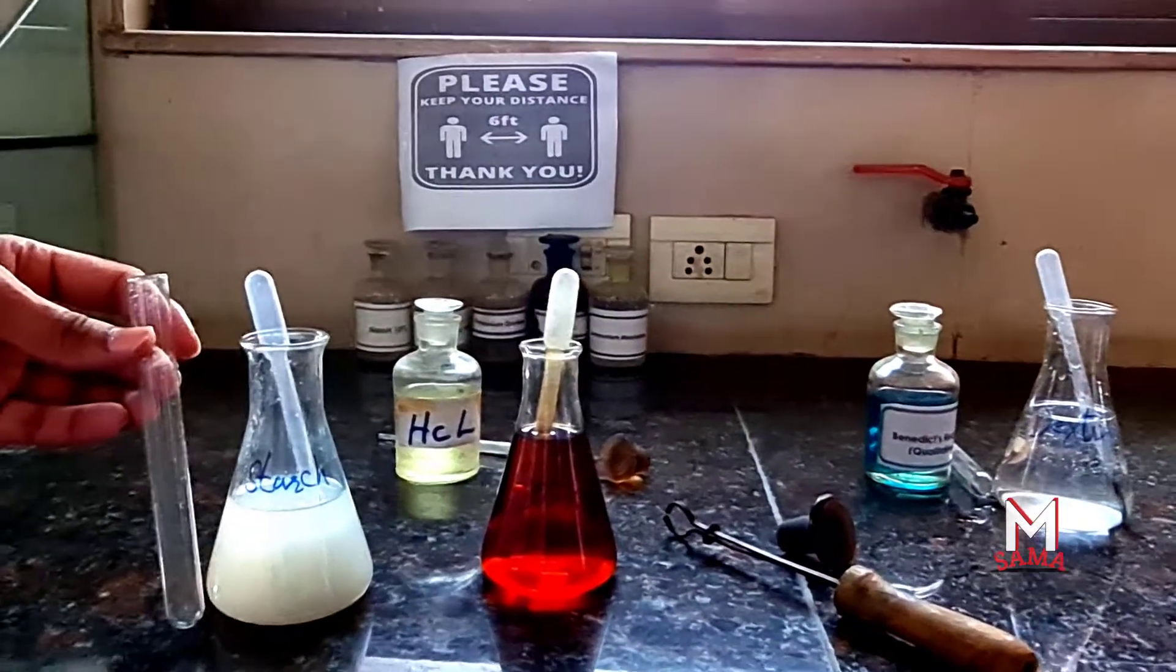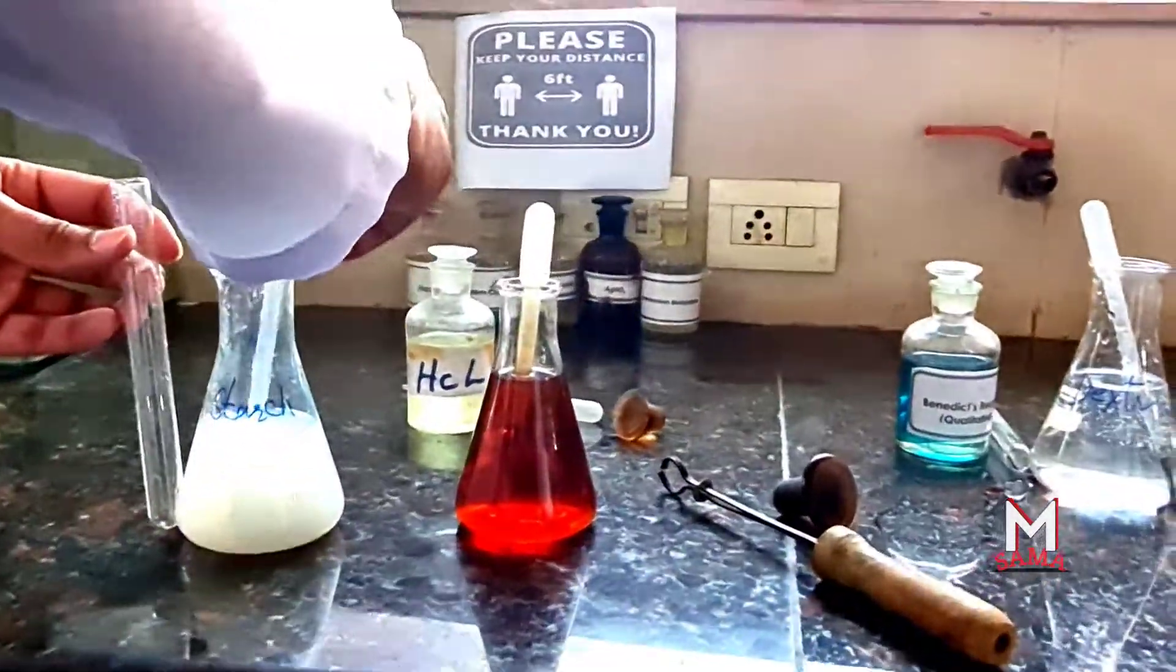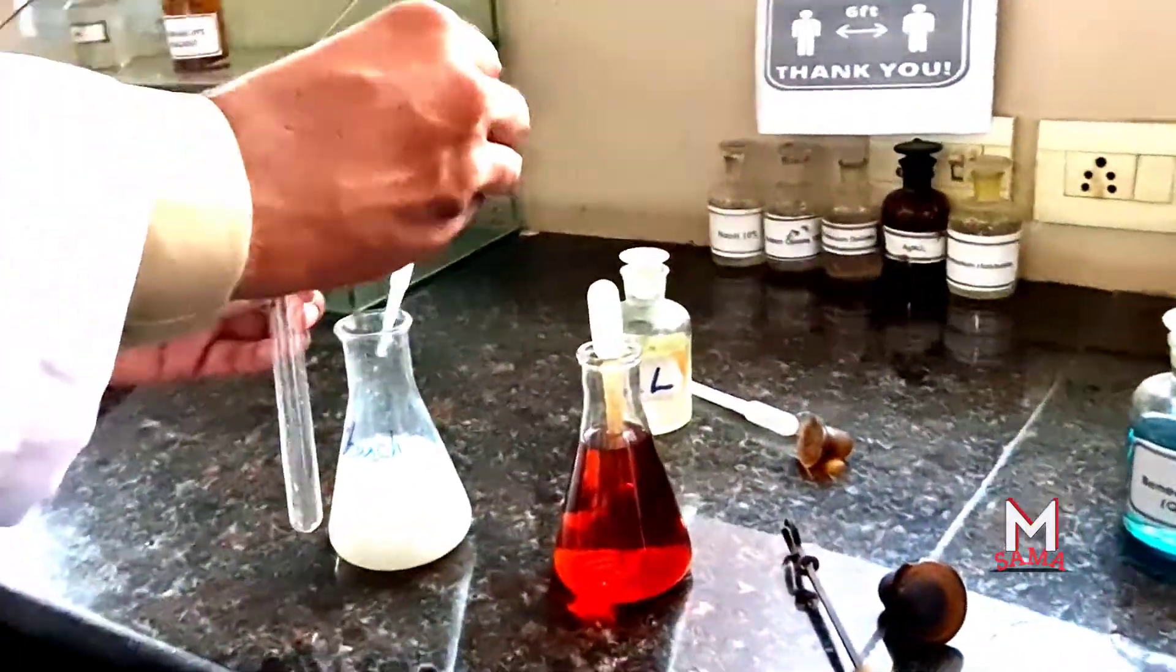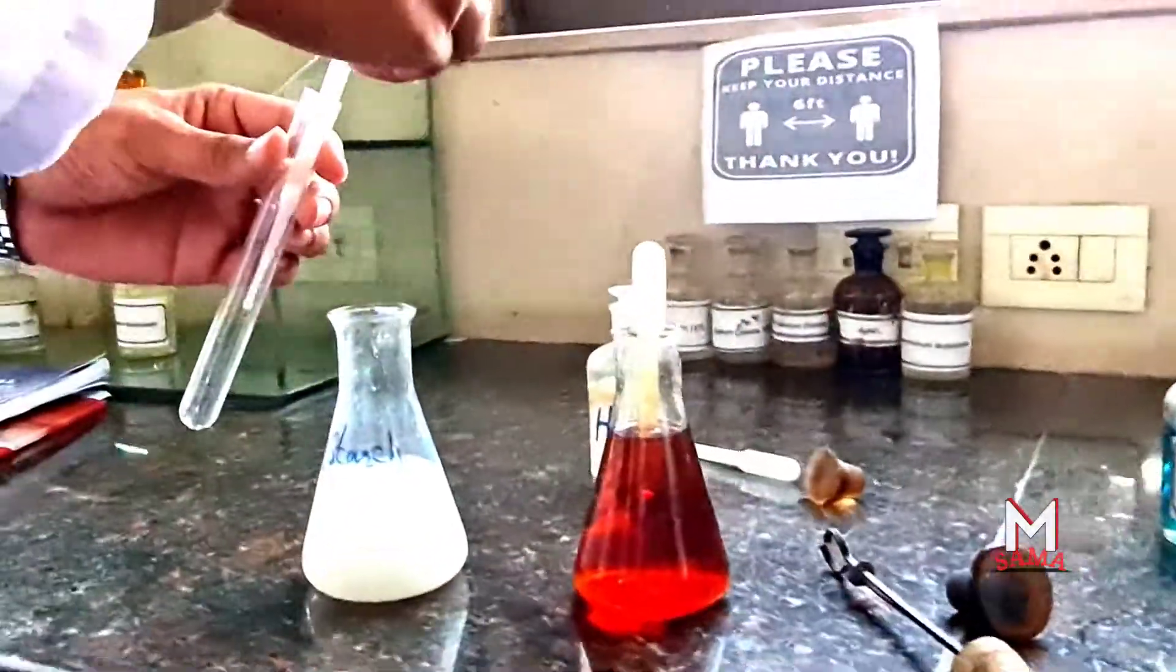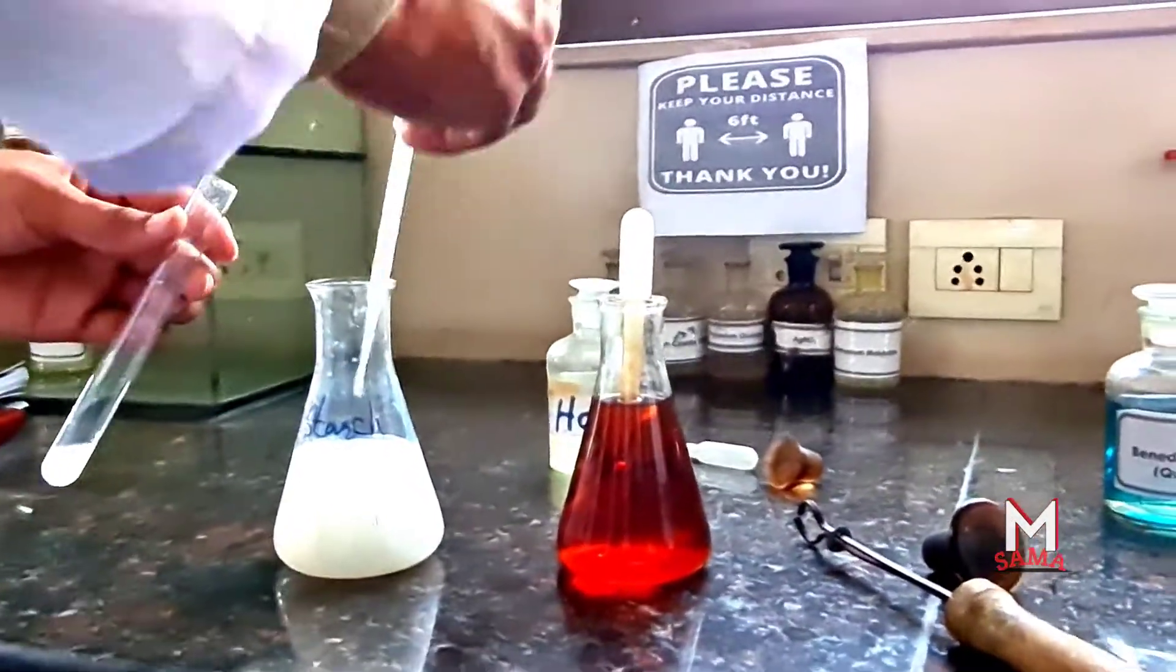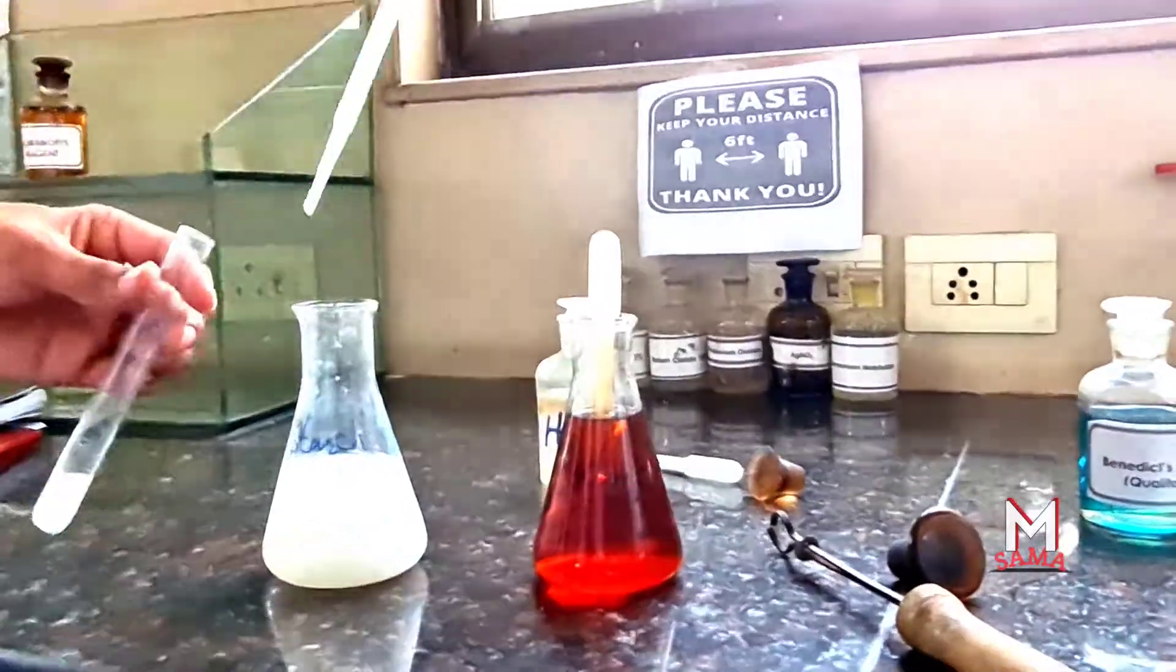First of all, take a clean test tube and add 3 ml of the given solution which is to be tested for the presence of starch. In this case, the given solution contains starch, so we will call it starch solution. We will add 3 ml of starch solution in this test tube.